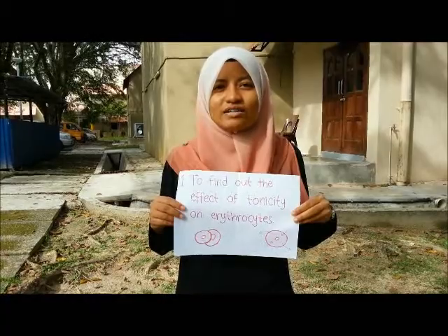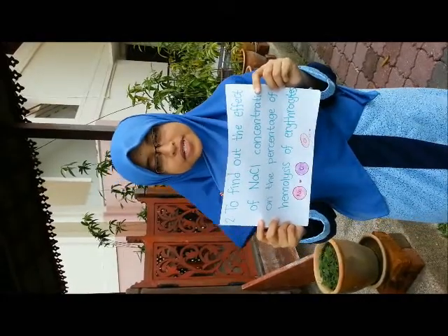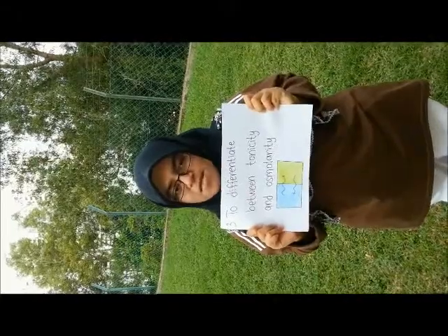Effect of tonicity on erythrocytes. Secondly, to find out the effect of NaCl concentration on the percentage of hemolysis of erythrocytes. And finally, to differentiate between tonicity and osmolarity.